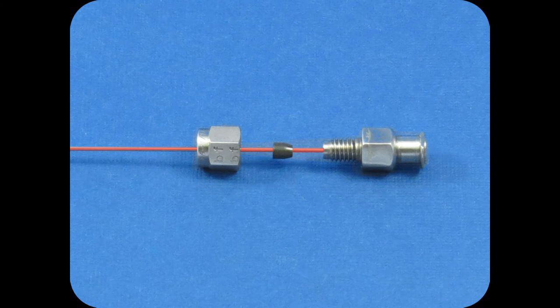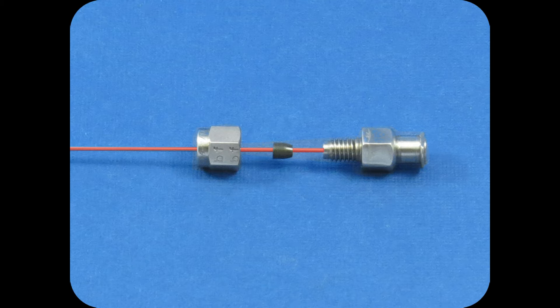To make a custom dispensing needle, the first thing you'll need is some length of hypodermic tubing. This can be tubing that you cut yourself or it can be our pre-cut or bent pieces of hypodermic tubing.